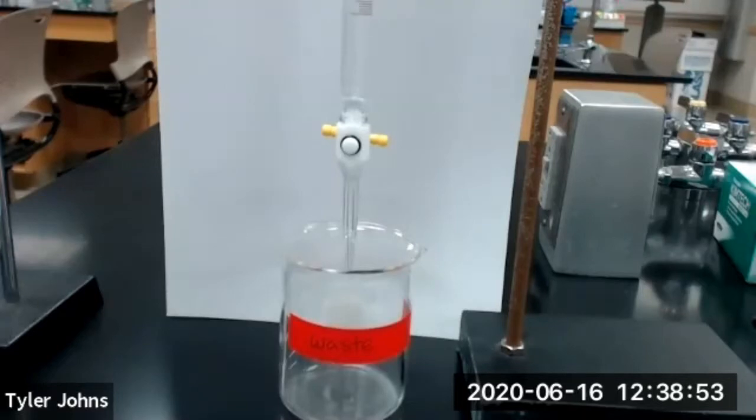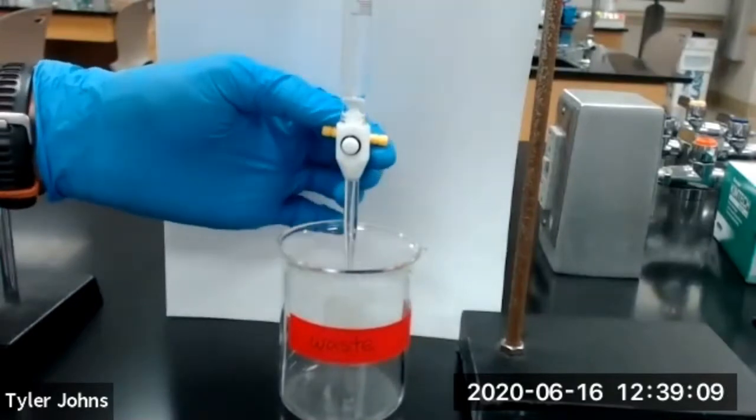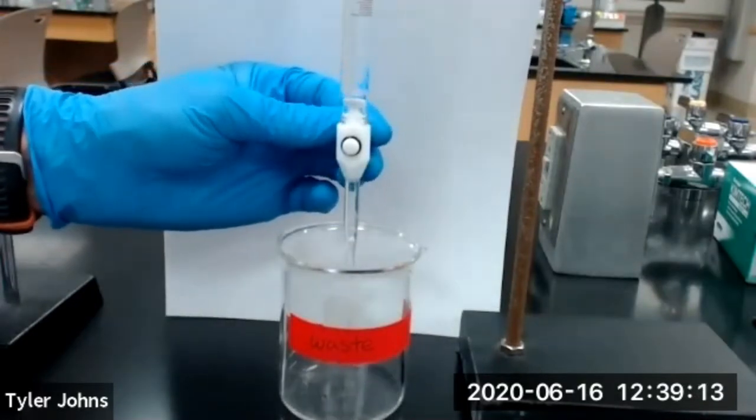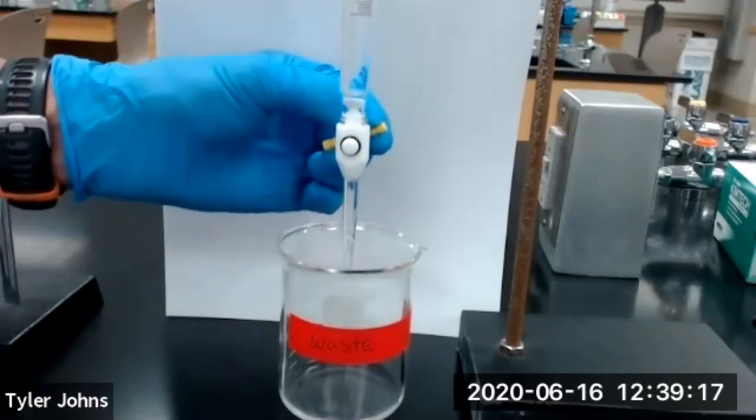We next want to open our stopcock, allowing the solution to drain out into a waste beaker until the tip of the burette is filled. We want to make sure that we remove any bubbles from the tip of our burette. I'm going to go ahead and open the stopcock. You can see how we removed the bubbles. So now we can go ahead and close it.